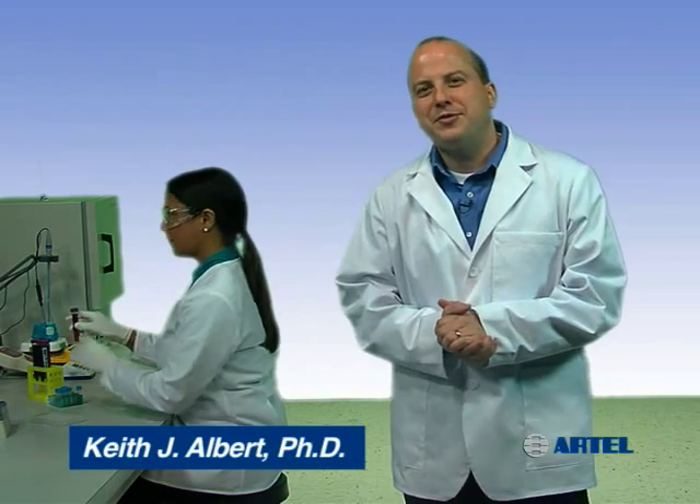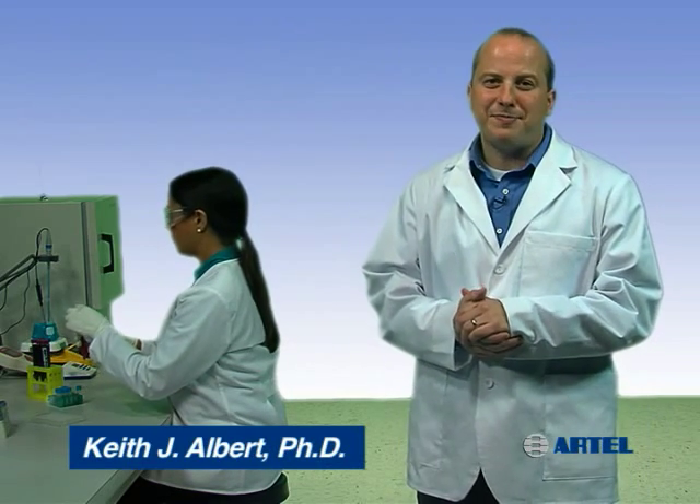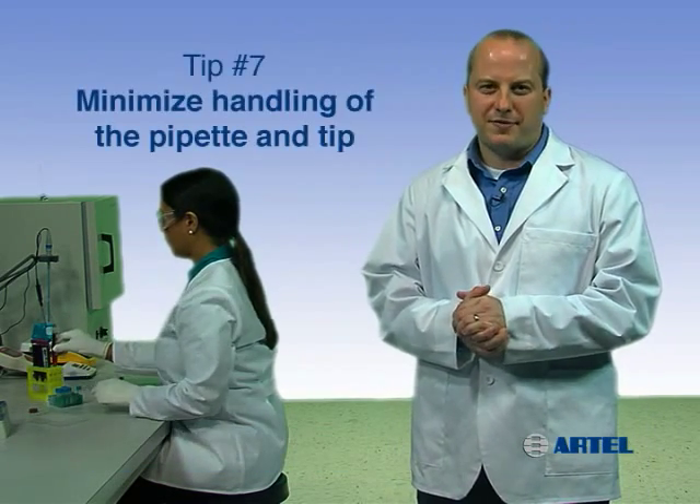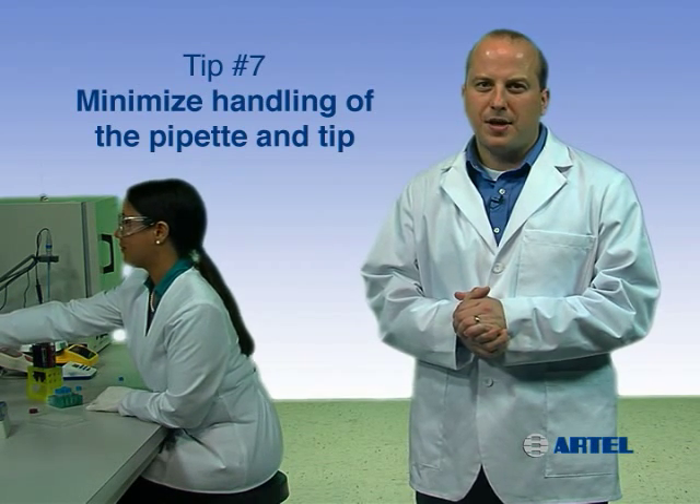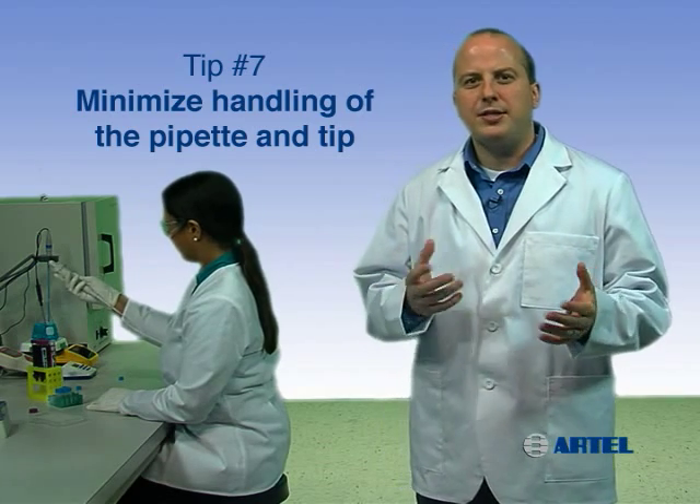Proper pipetting technique can help you ensure liquid handling quality in your lab. Pipetting tip number seven is to minimize handling of the pipet and the tip. Avoid over-handling the pipet and tips, as body heat transferred to the pipet during handling disrupts temperature equilibrium.